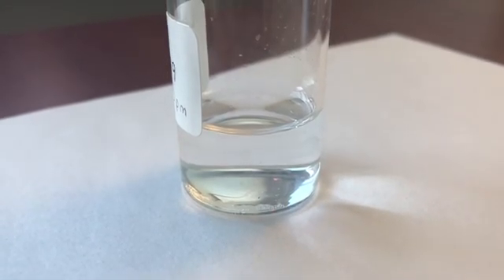As the amount of solvent decreases, the solute concentration increases and the solid will precipitate from solution because there's more solute than the solubility of the solution permits. Over the rest of the quarter, as the solvent slowly evaporates, we can observe the growth of the alum crystals in the vial. This experiment was conducted 5 days ago.